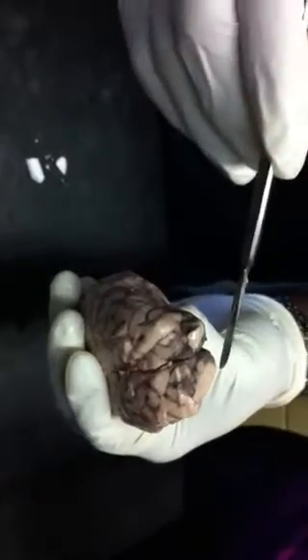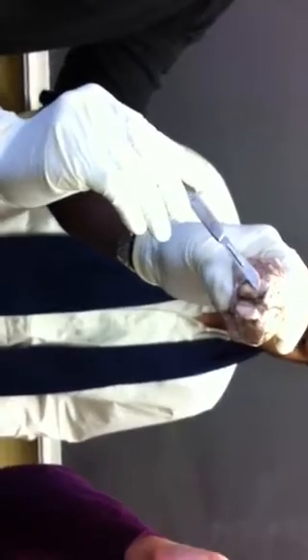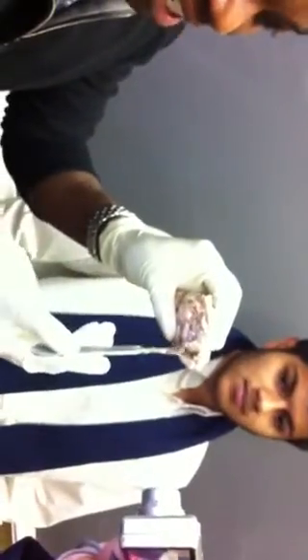They're in the front of the brain? Yeah. Can you see it? This is the front of the brain. It's inferior and anterior, like in front. So if you point to anything in front of the brain and down, it's the olfactory bulb.